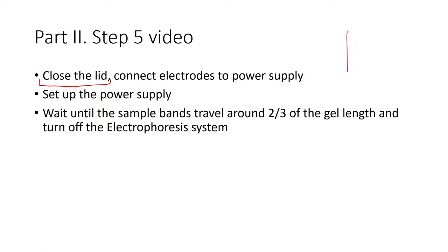After you loaded all the wells you will need to close the lid and of course you have this tray here with two electrodes one will be red the second will be black. Black is usually for negative and red for positive. You should connect them color to color so red to red and black to black. On the video you will see the four columns of the connections and you will need to use these columns because they are related to the same output. If you plugged red to this connector you should plug the black to the same column connector. This is the right way to connect. If you want to use red here and black here it won't work and you will see the error message on your screen.